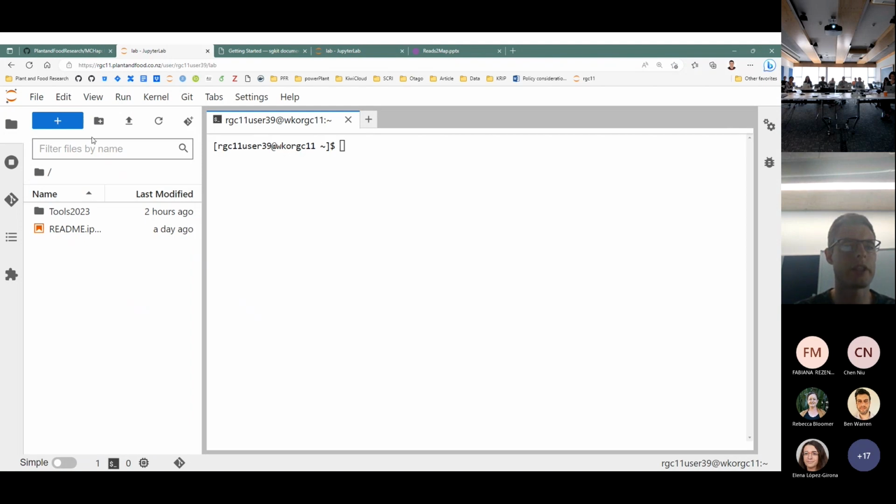So this is just on the same server you've all just used. We're also going to be using Docker here. However, we're not going to be using it properly because we just put MCHAP into a Docker container to make it consistent, so we're all using the same version.